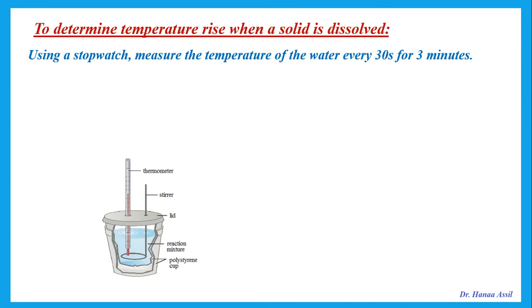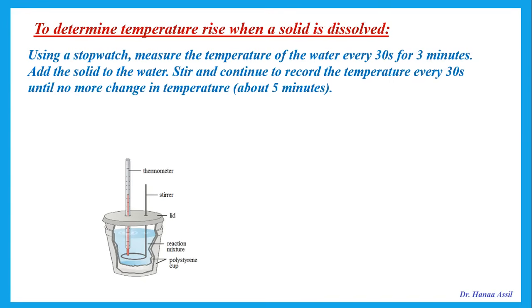Now, at the beginning, I measure the temperature of the water alone for 3 minutes. And then I add the solid to the water and I continue to record the temperature every 30 seconds until there is no more change in temperature.